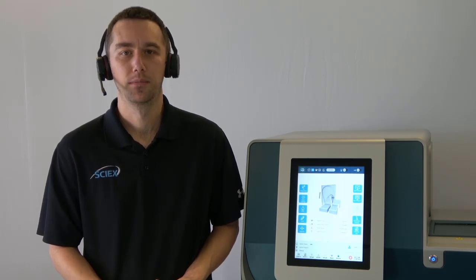So for our CE-SDS analysis with standard UV detection for AAV purity and VP ratio, we typically start with at least a 1-to-1 dilution of sample into our sample buffer. And that really depends on the titer, the concentration of our initial starting sample. We'll have that 1-to-1 dilution, then we'll add a certain amount of reducing agent. Typically for UV analysis, we'll add beta-mercaptoethanol. And then we'll heat it for a certain time at a certain temperature, and that is really serotype dependent. Certain serotypes are going to need a little bit more heat to fully denature the proteins. Other ones will more readily denature and break apart the capsid.